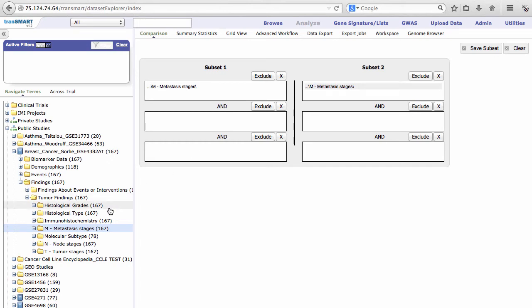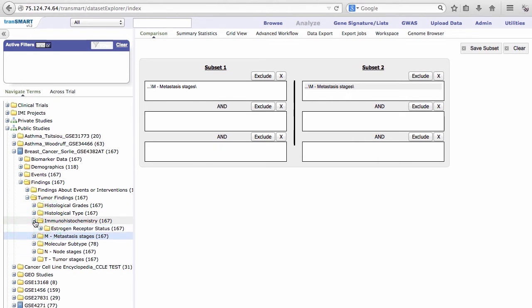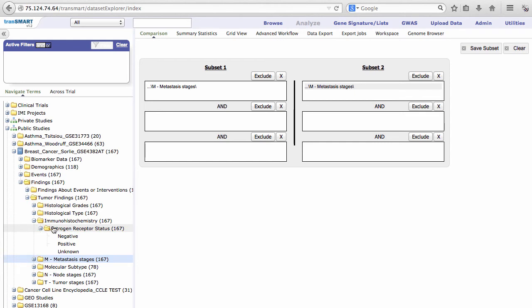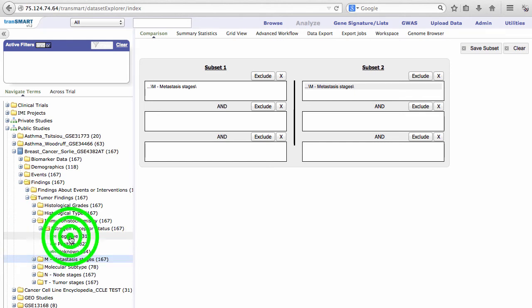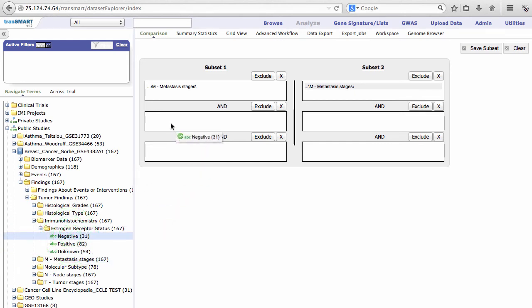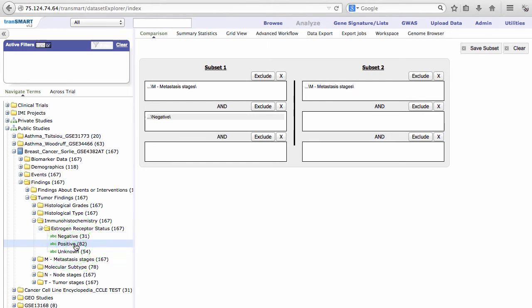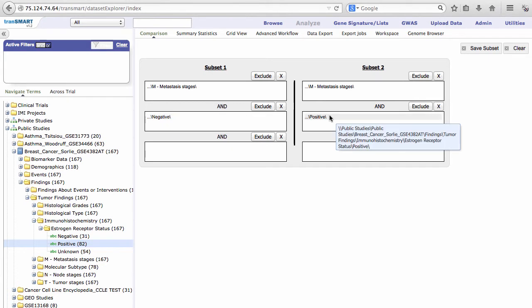Back in the Study Tree, find the Immunohistochemistry folder and expand it as well. Expand the Estrogen Receptor Status folder. Drag the Negative Data into the second box under Subset 1. Drag the Positive Data into the second box under Subset 2.